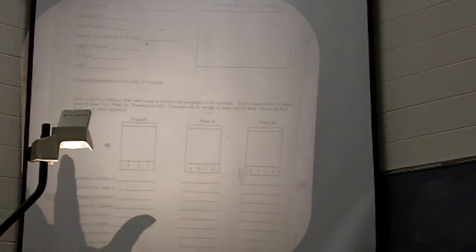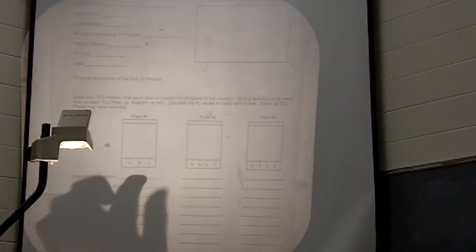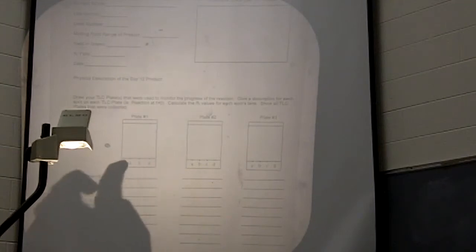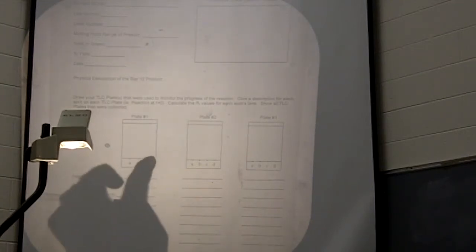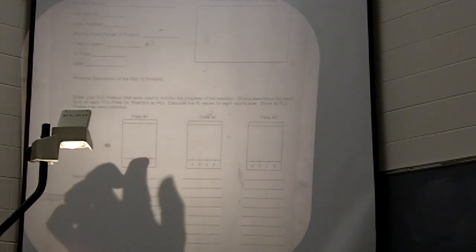For this report form, you're going to show each TLC plate that you created for this experiment, and give a description of each spot. So, description of spot A: tell me what that spot corresponds to. Is it the reactant standard, the N-phenylmaleimide standard? Is it the product standard? Is it the reaction mixture at time 0? Tell me what that spot is.